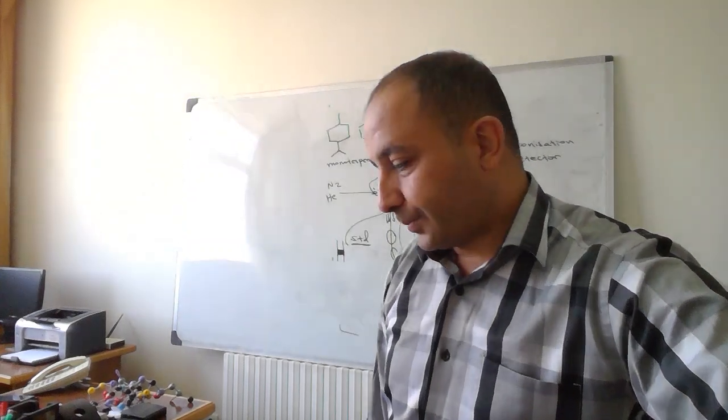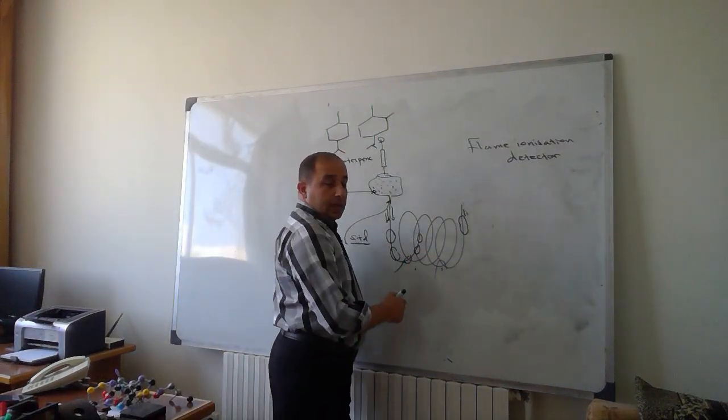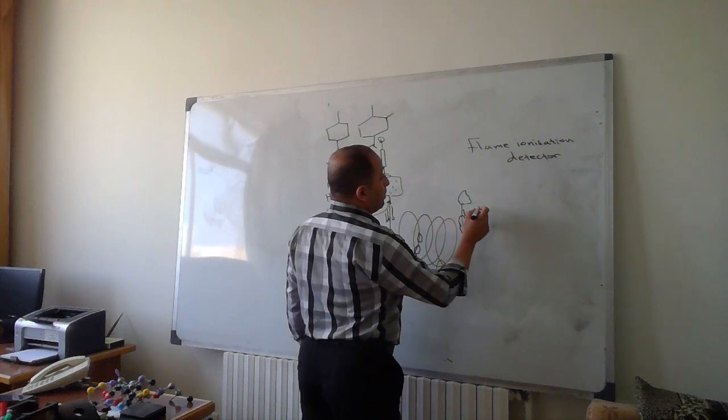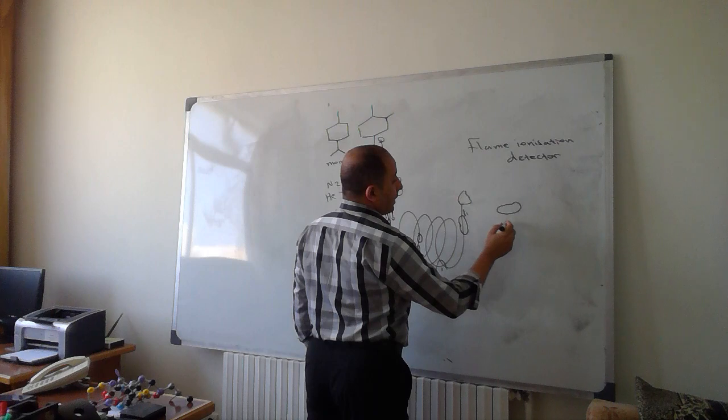Now the idea: once the compound comes from the column as a cloud, it will be burned by a flame, like this one.